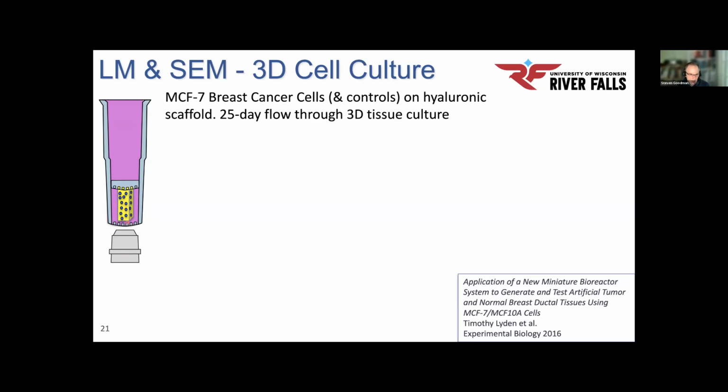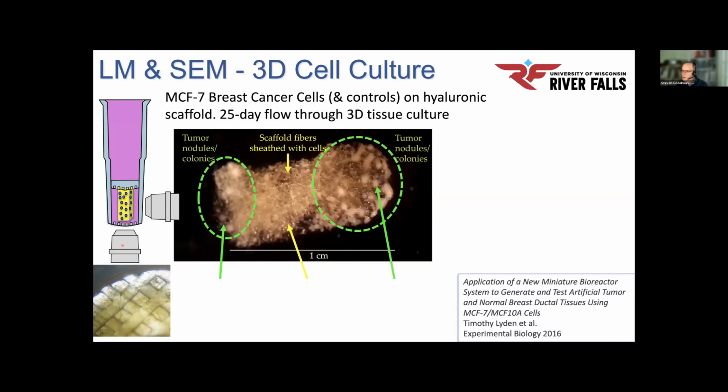Now, one can use a light microscope looking through the holes in the capsule on the bottom and through the transparency of the capsule, and have a reasonably good, not a great quality, light microscope image. And this is bright field, nothing is stained in here, and one can make out the filaments of the scaffold in this particular image in here. But you could also image the scaffold from the side by simply laying it down in an inverted microscope and obtain pretty nice images, and again, bright field in this case.